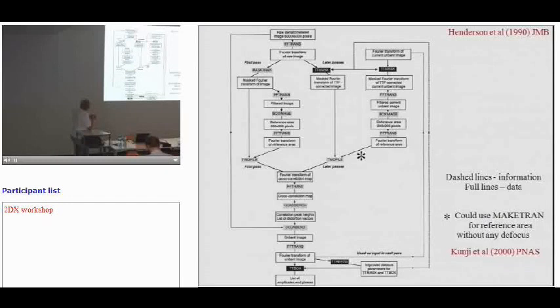So the idea is you take your raw densitometered image, or digitized image if it's from a solid state detector, and obviously the bigger the crystal, the better, the more unit cells and so on, and you Fourier transform it, index it, get roughly your parameters, so that you know where the crystal is, and then mask it off so that you're doing some averaging. Otherwise, it's a very noisy image. And then once it's masked, you've got a masked filtered Fourier transform, if you like.